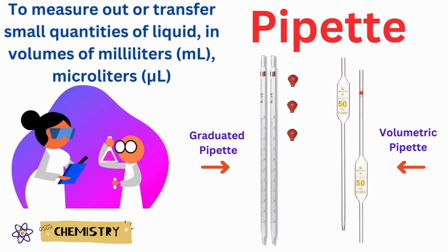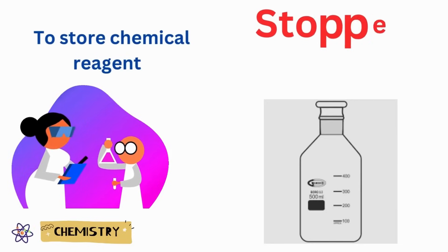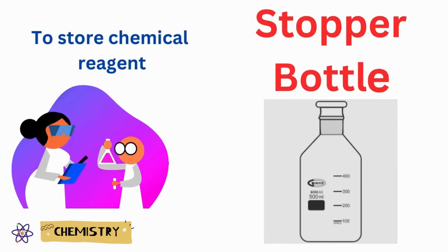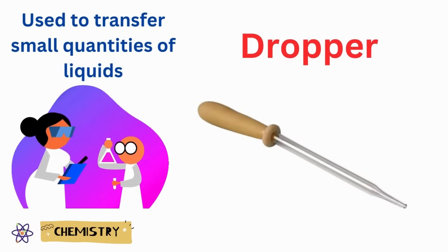Pipette. It is used to measure out or transfer small quantity of a liquid. Stopper bottle. To store chemical reagent. Dropper. To transfer small quantity of liquids.